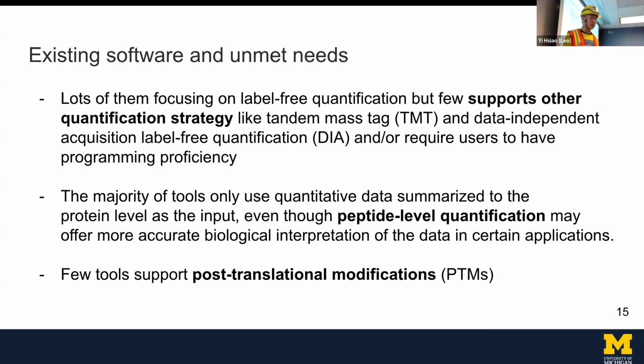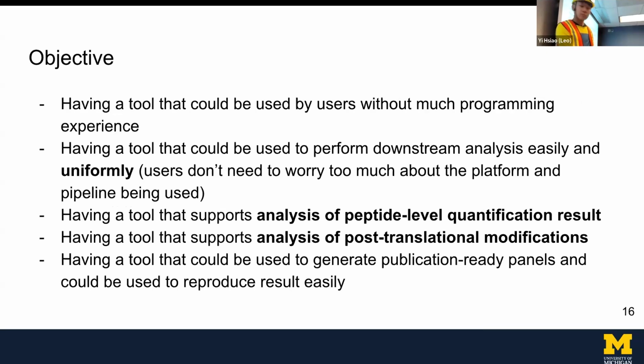Another change is that lots of proteins go through post-translational modification. They are really site-specific, and we want to look into different mechanisms. For example, phosphorylation is one particular mechanism. Only particular amino acid residues will be the focus, and every protein has many residues that can be phosphorylated. So we really want to do analysis at the site-specific level.